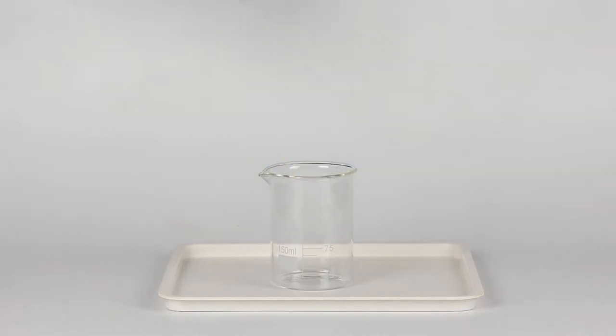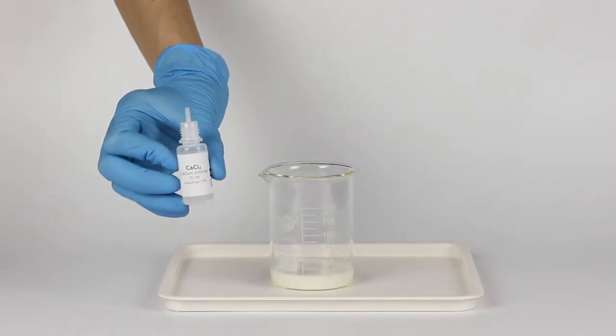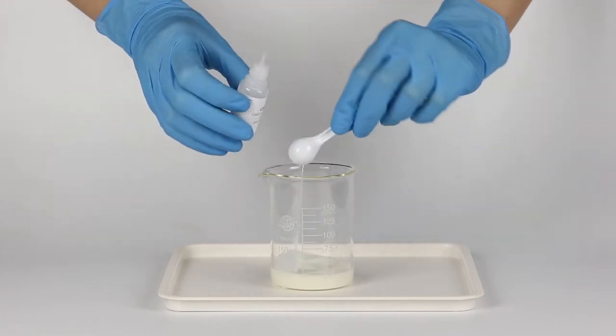Pour approximately 25 milliliters of milk into the beaker and add two big spoonfuls of calcium chloride solution.